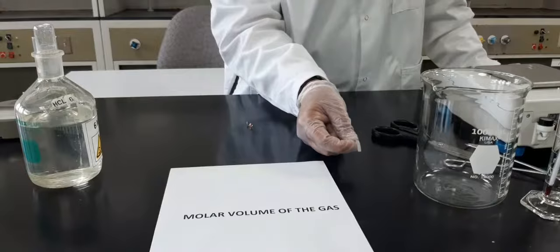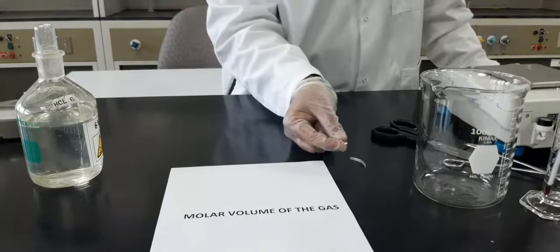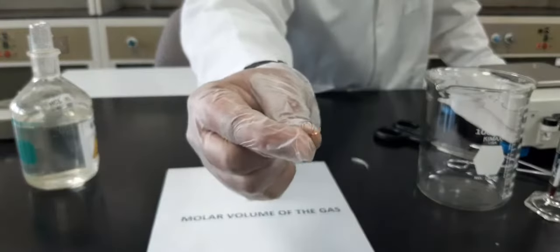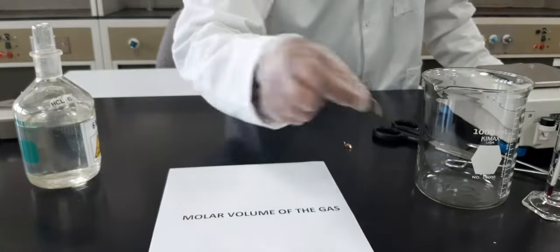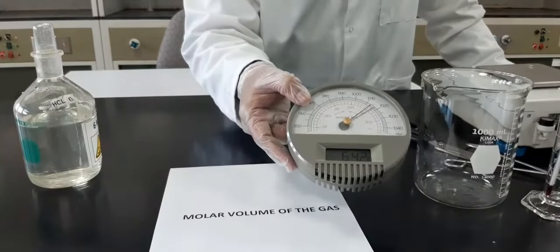This is a piece of magnesium and the brown color is copper. You see, that's copper and that's a piece of magnesium. We require to find the mass of magnesium in this experiment. This is the barometer to find the pressure.